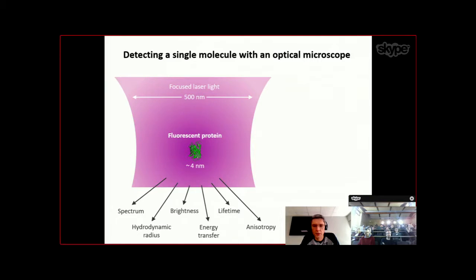Of course, you have better correction for aberrations. You have better chromatic aberration correction. You have larger, flatter field of view. But at the end, if you just want to detect a single molecule, you don't care about the field of view. Being a millimeter square is absolutely no point. You just want to do this experiment: have a single molecule as your object, excite it and detect it.